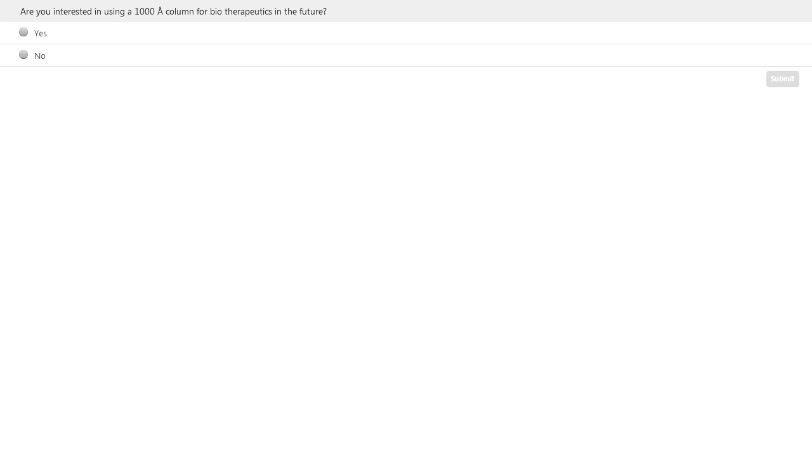Well, SEC, you're operating under different conditions. I would say that you should know what you're trying to achieve by doing the separation.